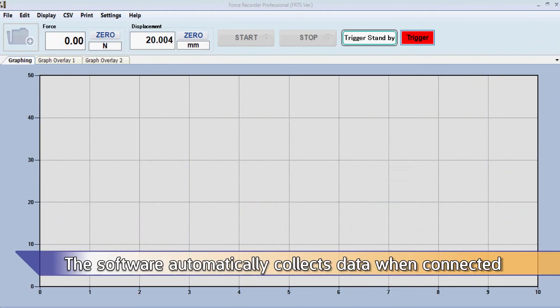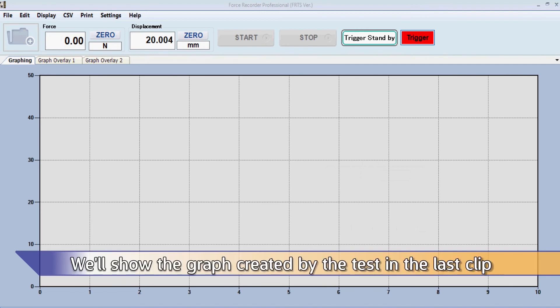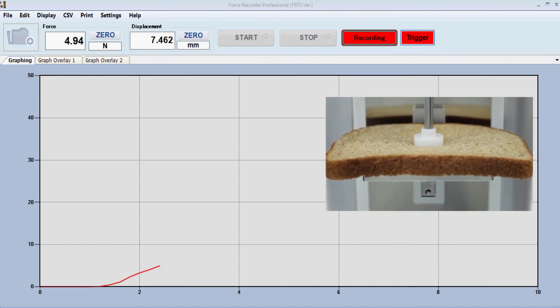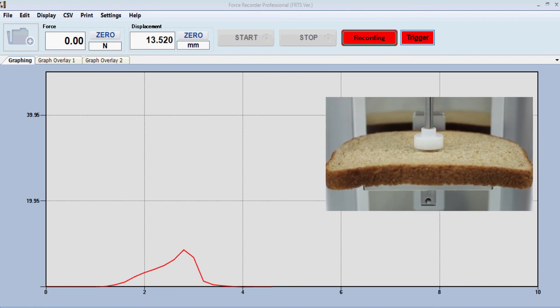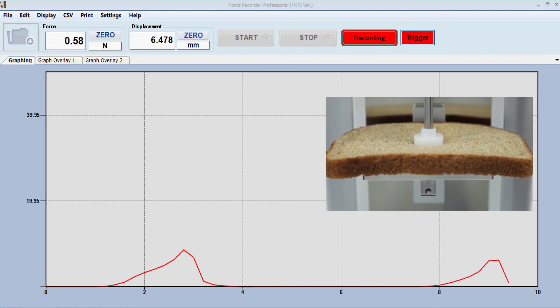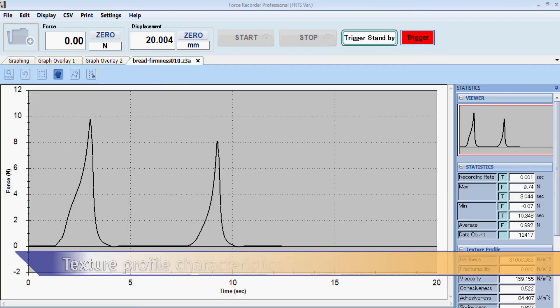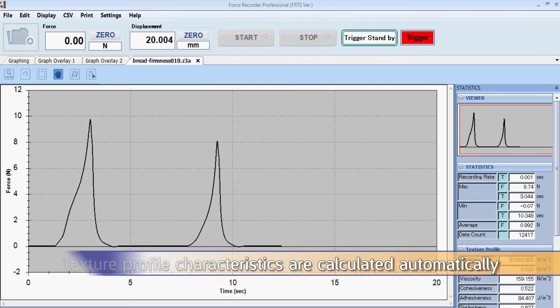The software automatically collects data when connected. We will show the graph created by the test in the last clip. The texture profile characteristics are calculated automatically within the software.